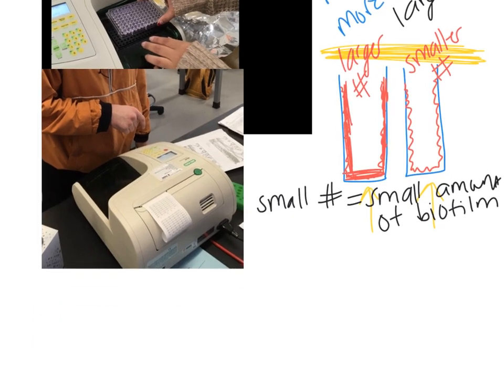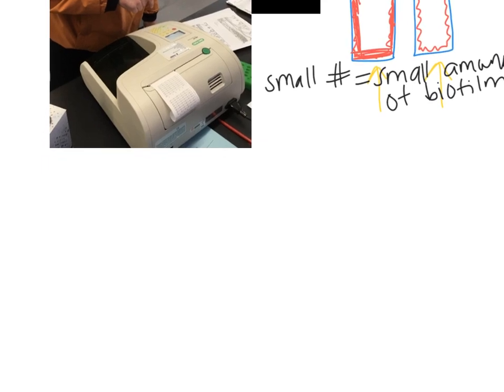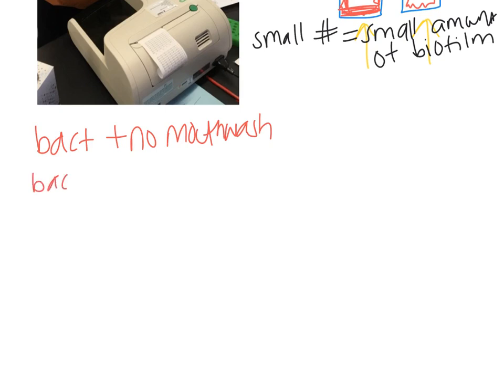To conclude this video, you are now ready to start looking at the actual lab. A few quick pointers on the actual lab. What you are given in the lab is 12 wells containing bacteria with no mouthwash. You are also given 12 wells containing bacteria and mouthwash. Your goal will be to figure out, does this brand of mouthwash inhibit bacterial biofilm growth for this particular species?